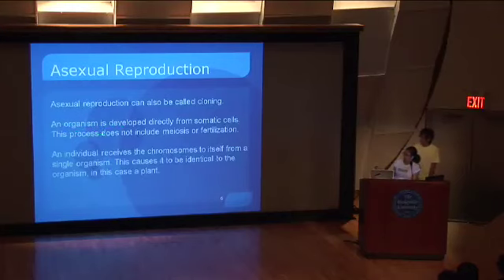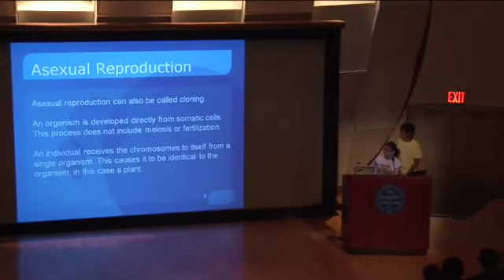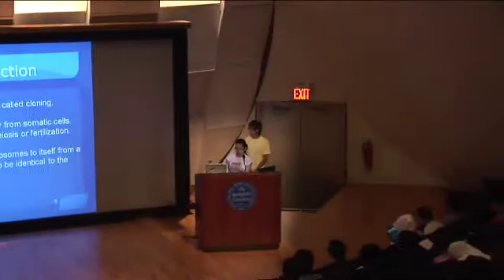What we did was take the plant, cut it up, and put it into what our professor had prepared for us, which was a medium. It was inside a little tub, and when the plant touched it, the chemicals would make it start reproducing itself.